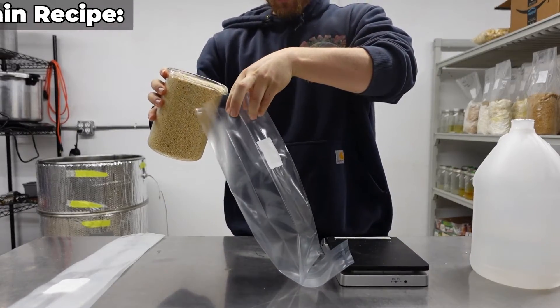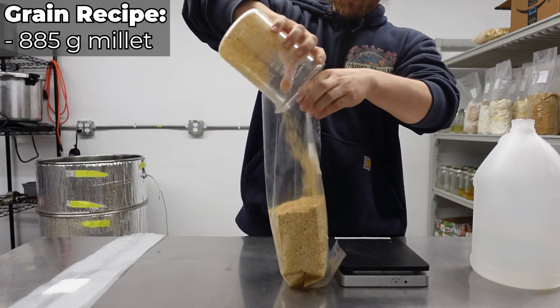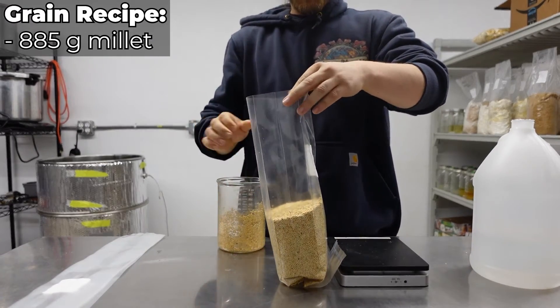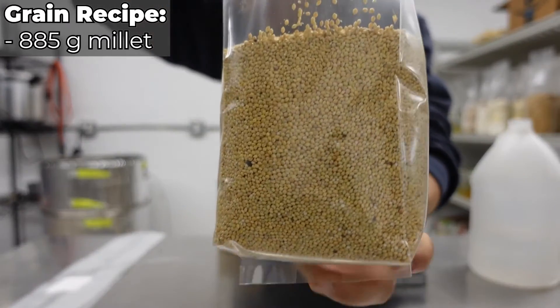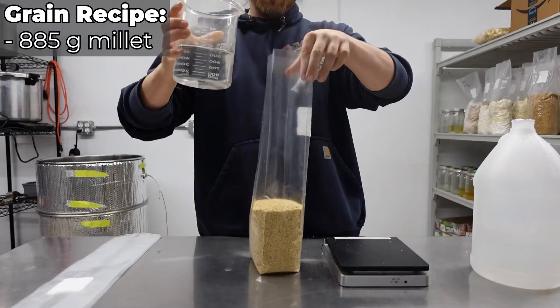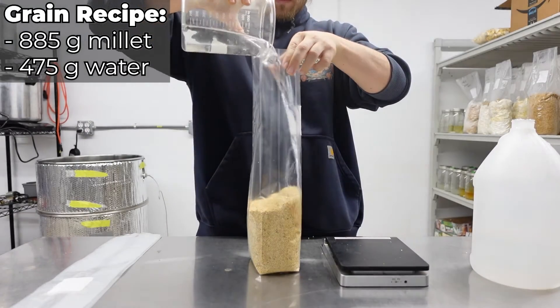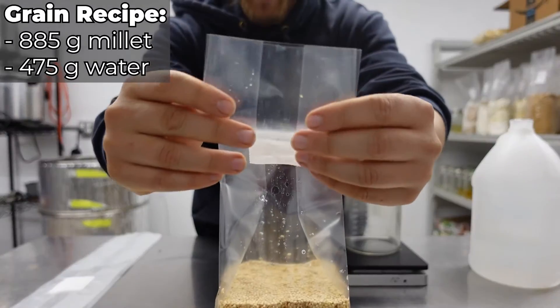To prepare your grain, start by adding 885 grams of dry grain to a filter patch bag. I'm using millet here, but you could also use brown rice, corn, rye, or any whole grain that's available to you. Now add 475 grams or milliliters of water to your bag and fold it up neatly.